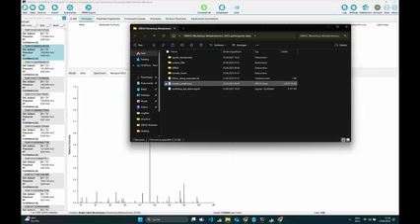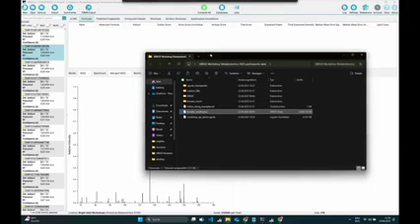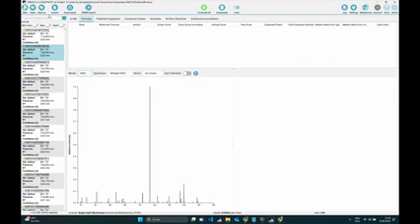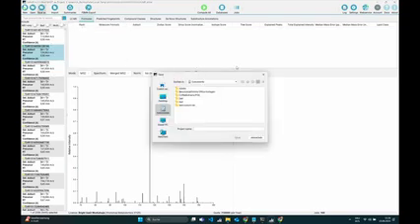But before I show this, the last thing I want to mention for this old dataset: if you now do your computations and you want to save them, there's of course the Save As button. What you can see here in the title bar, it's a little bit small, but what you will see on your machine if you follow along, is that even if you just load in data, it will be saved somewhere, but only in some temporary location. So if you want to keep your stuff, you will just click Save As, and then you will set a name for your project, and then it will be saved.